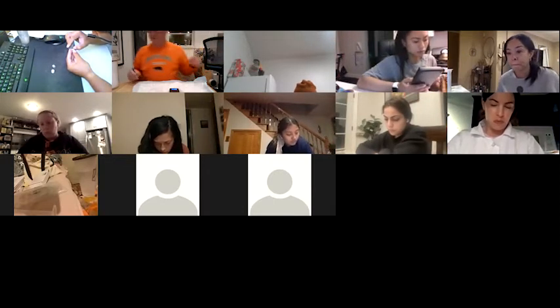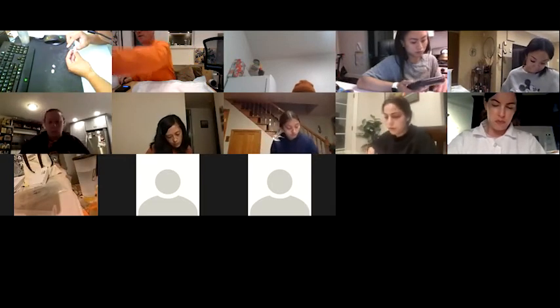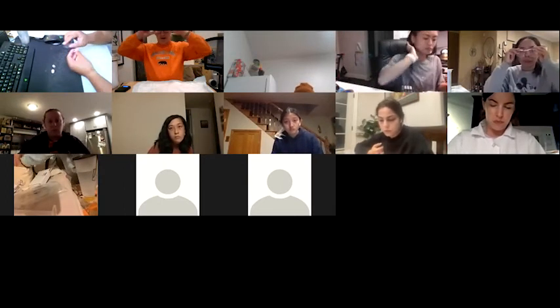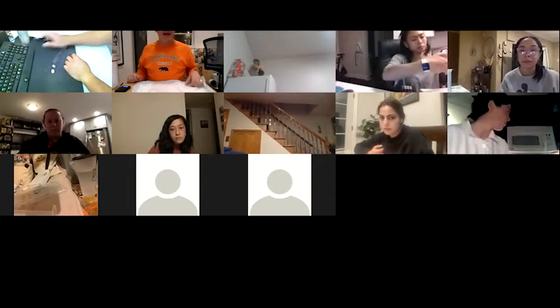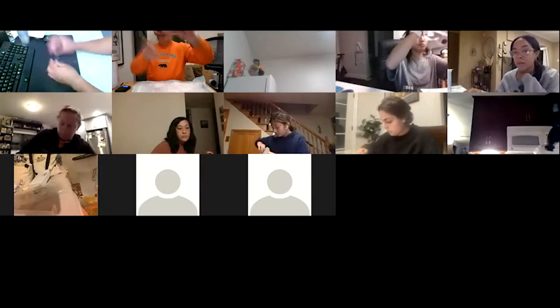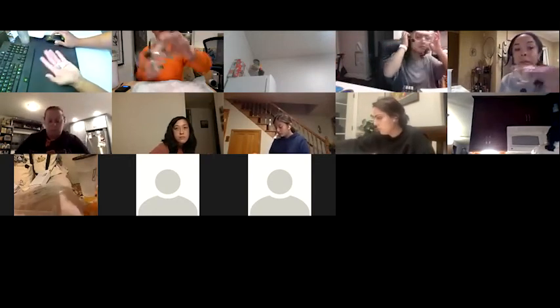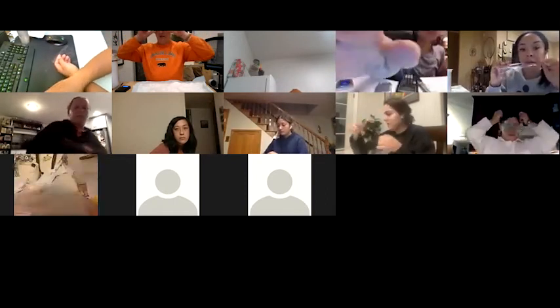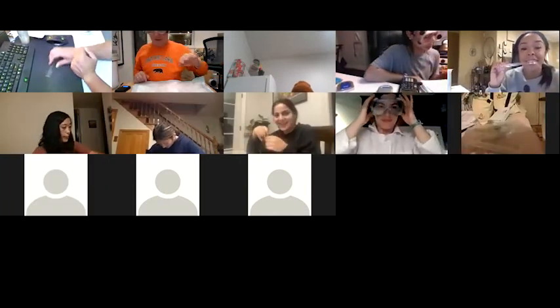All right, so that part is pretty straightforward. Next, we put on our goggles. Yeah, because we don't look nerdy enough. Nice and nerdy. Even if you're wearing glasses, it's a good idea to have them on, because these have sides on them that your glasses do not. So even though it's a pain, you may think you look like a dweeb. You do look like a dweeb, by the way. We all look like dweebs, so it's fine.